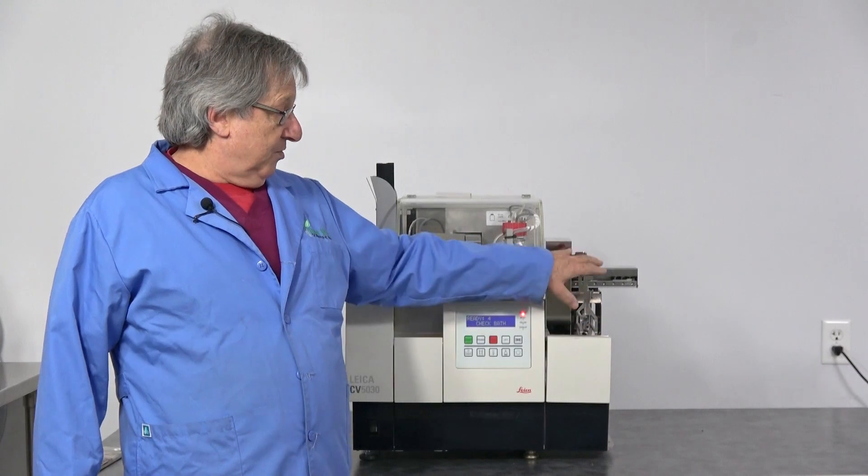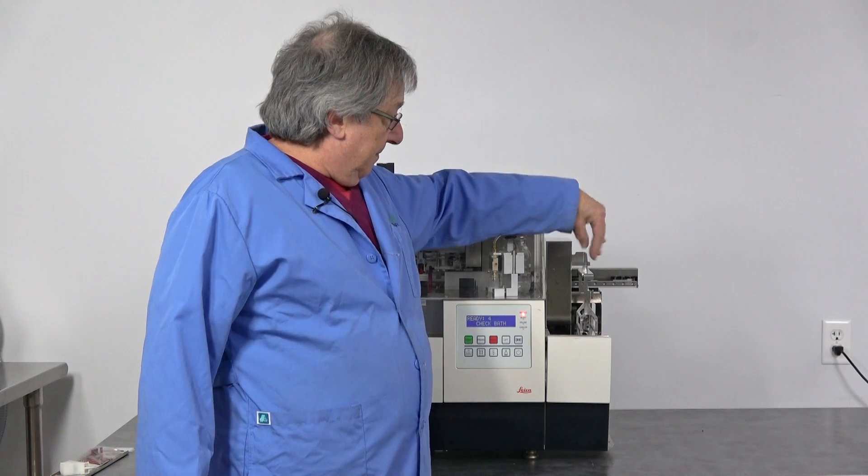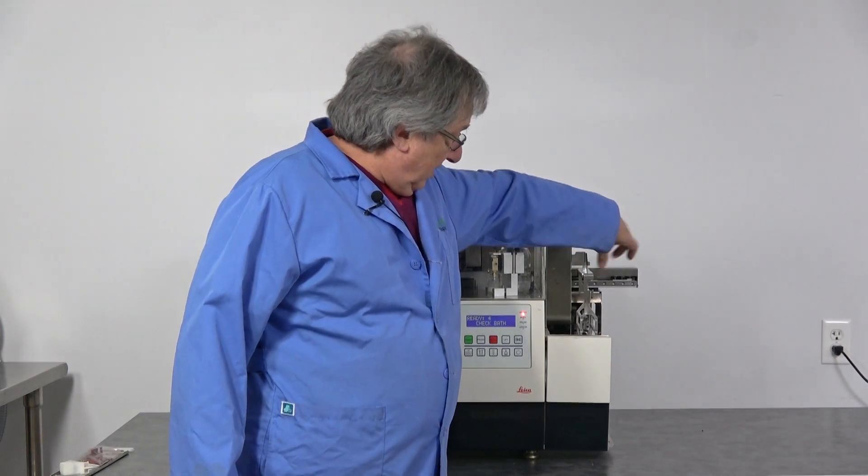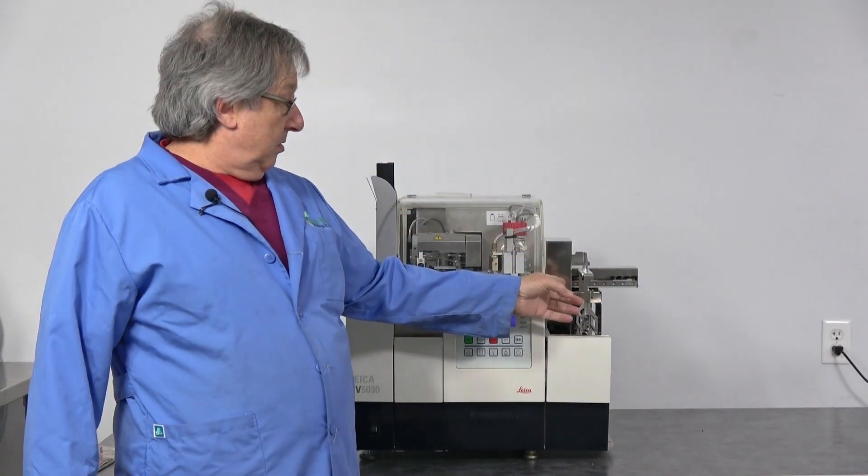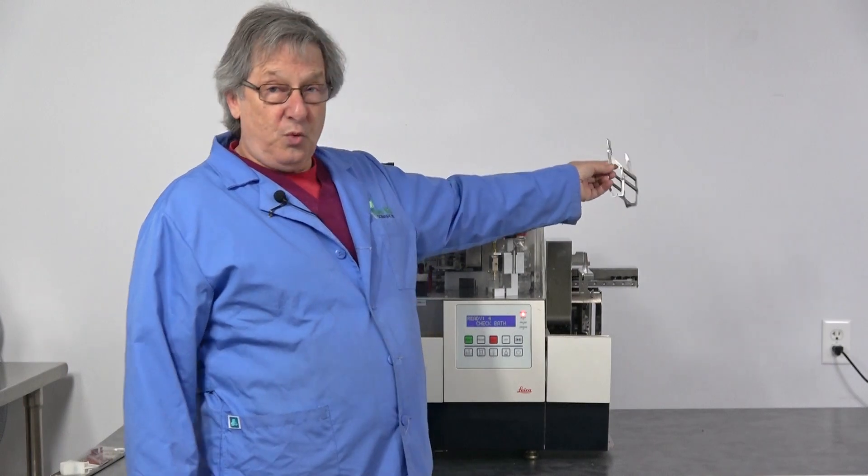This transfer station is for an ST5010. You can tell because the crane where it picks up the baskets and slides comes out the front. The other is in the rear.